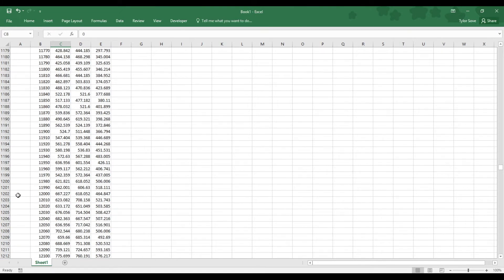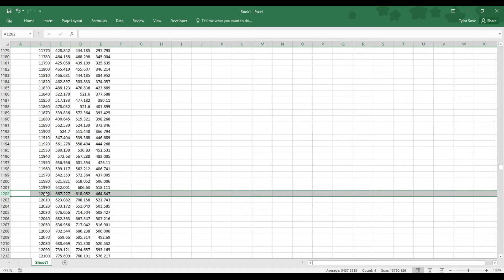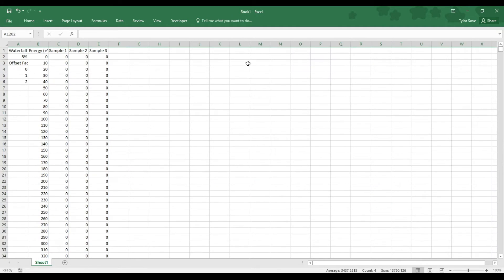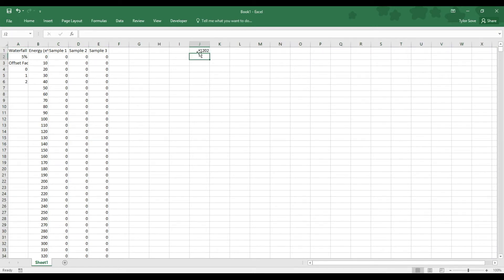Right over here, 12,000 EV corresponds to column, or apologies, row header 1,202. So we'll just make a quick note of that number, somewhere off to the side. 1,202 is what we are concerned with.